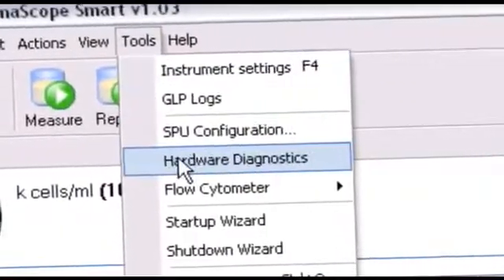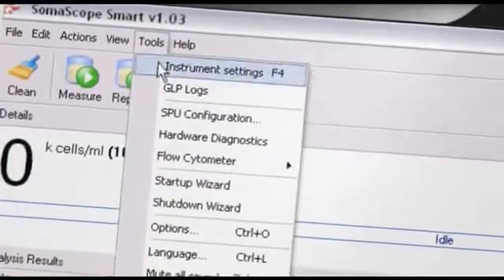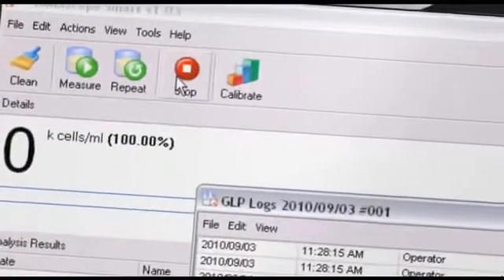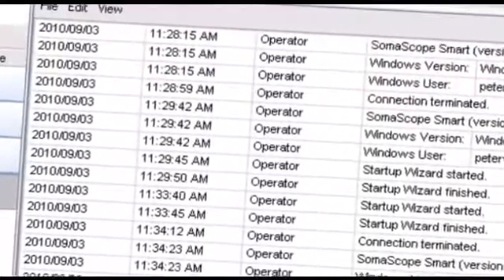The software also includes checking and adjusting areas of the hardware. Another useful tool is the GLP log. This stands for Good Laboratory Practice and it enables the user to track all the previous actions.